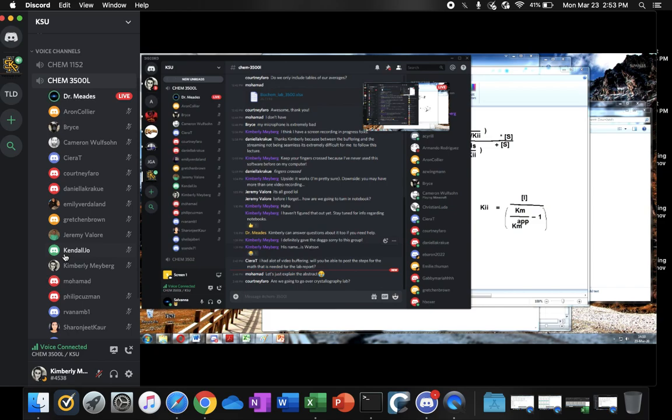And again, we'll do crystallography, and I'll explain everything you need for that. You only have to download the program. That's it. It's really, really small. It's a safe program to download. I've been using it since '97, so like 23 years now. So it works great. It's a little clunky because it's freeware, cheap.